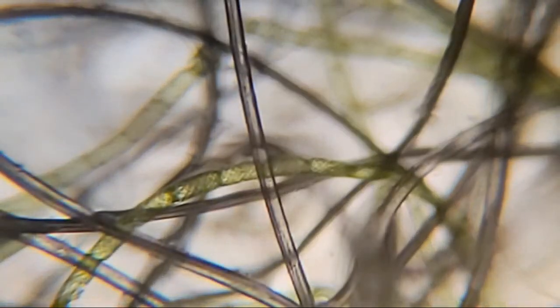This next sample is three months old, but I used aquarium water and hardscape from a tank that is two or three years old — this is the lake inlay tank aquarium. Here you definitely see a lot more strains of algae. To me it looks like less bacteria or less fungi growth, less of the hair crystalline things that are networked. The filaments still look pretty clear and they're not breaking down. I'm still not seeing a whole lot of life in this little sample. So let's slide over to the three-month, no-filter-start sample — I would expect this to be the least of all of them or equal to the first one.